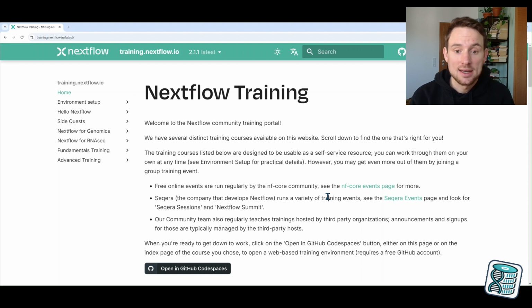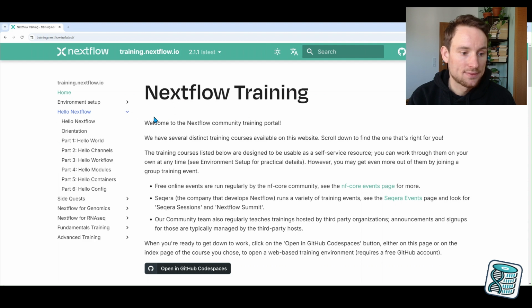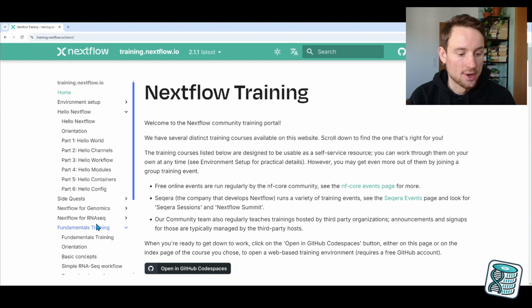So let's get started. We're here in the Nextflow training resources. And this is the best place to start, obviously, if you want to educate yourself on Nextflow. There's a number of really helpful tutorials. You can start with the Hello Nextflow section here, which is explaining all the basic concepts and a number of examples. And then there's a fundamentals training, which is also a great tutorial to get started.